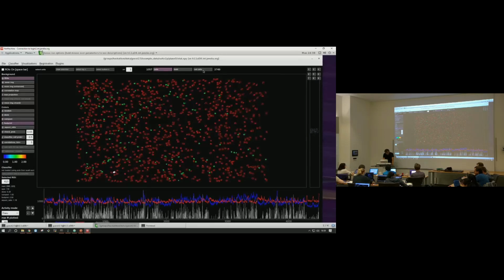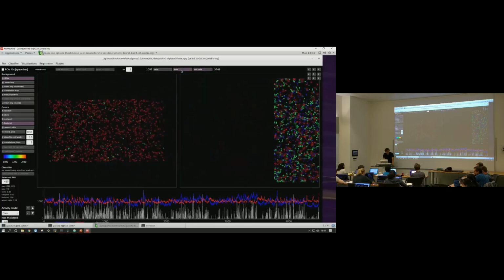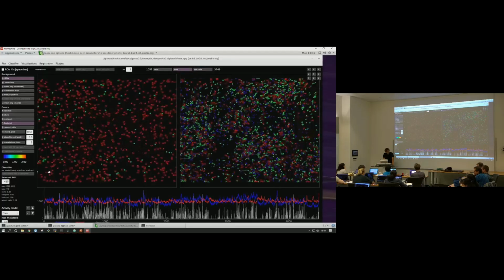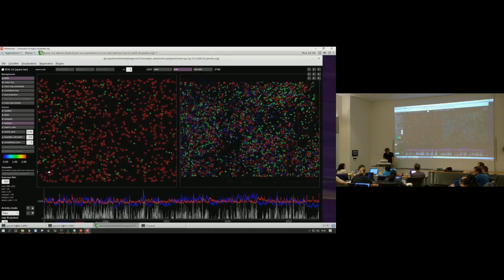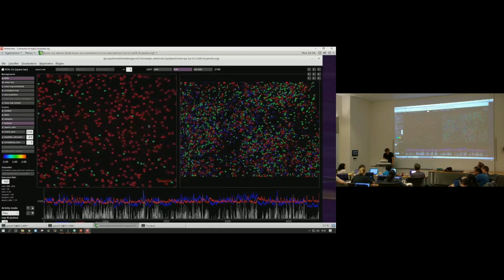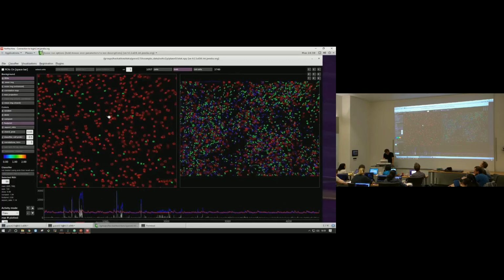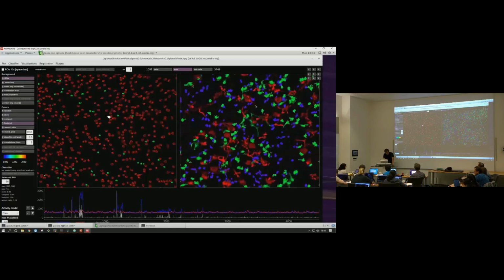So usually you don't want things that are either too large or too small. And if you look at the two views, you'll see, and probably the classifier in this case was very highly biased by this footprint because it mostly got us these cells with footprint 2. Again, it's probably an indication of the classifier being not quite well adjusted to this field of view, whereas we get all sorts of different sizes on the right.